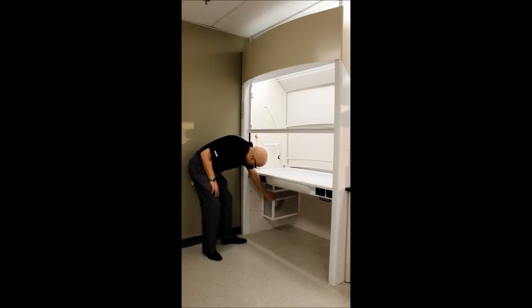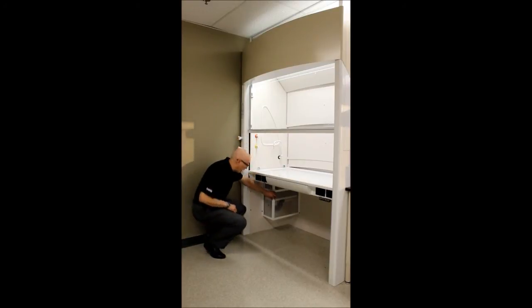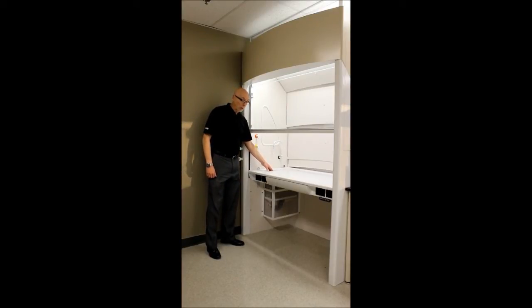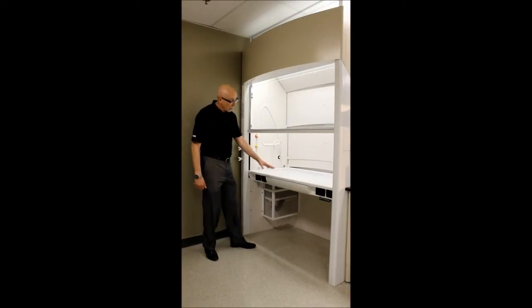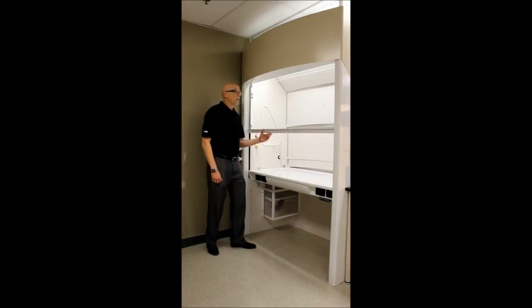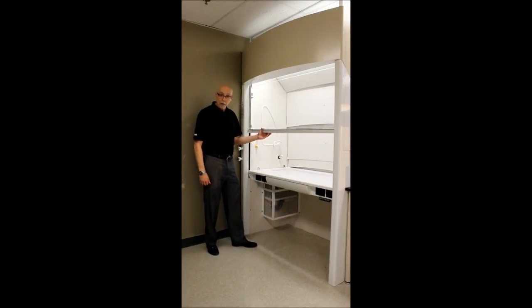Down here — shown in see-through glass so you can see what's going on — we have a telescoping connection for the cup sink. So even though the worktop goes up and down at the push of a button, you don't have to change anything with the plumbing for the cup sink. Also, as it raises and lowers, the baffle goes with it so that it is always drawing the appropriate amount of air. This fume hood can be used as constant volume or in a variable air volume system.